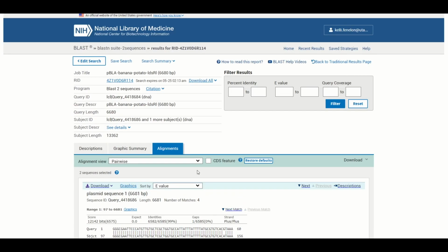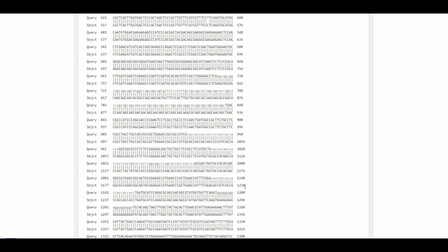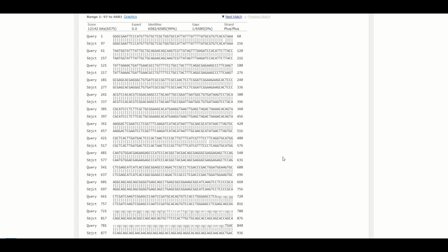And of course, BLAST is still great for searching genomes and mRNA databases. For that sort of thing, it's great. So if you sequence your plasmid and you have some weird sequence that you don't recognize, throw it into BLAST and see what it is.